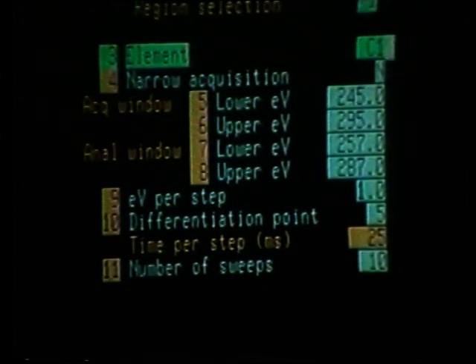Once again, we would need better peak resolution. For most applications, 1 volt per step is sufficient. We will then use a 5-point differentiation. When we calculate the atomic concentration, as in the multiplex, we can use the 5-point differentiation, measure the peak-to-peak height, and thus attain the atomic concentration.